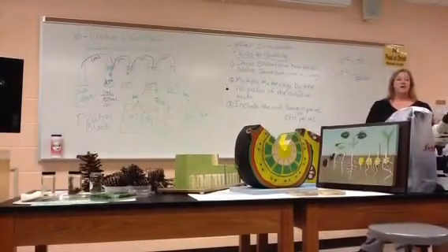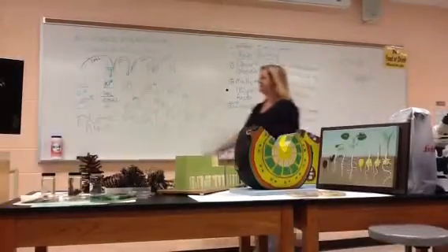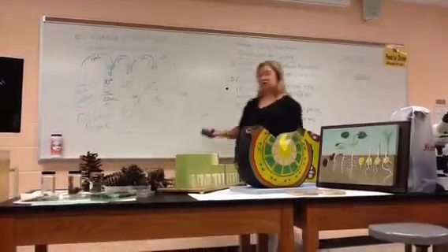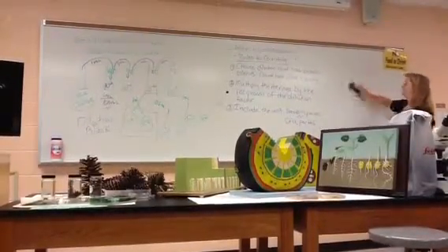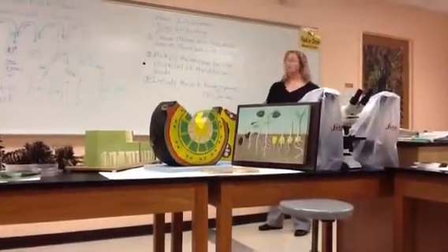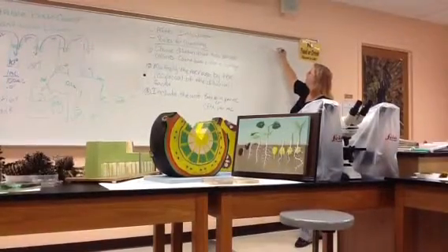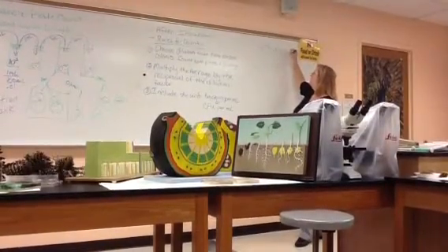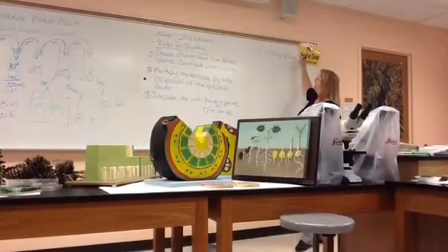All right, so let's say that you were to do that. Let's do a practice one here, because this is what your quiz question usually looks like. And actually, your lab practical exam question too. The student in lab did a viable plate count. They counted the 10 to the minus 6 dilution, and they found an average of 167 bacterial colonies.